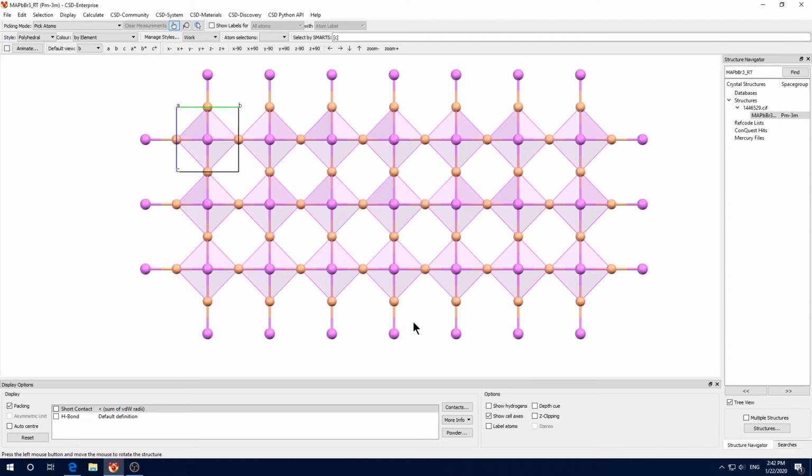Then the next step, I will show you how to customize your own favorite style. This is the default style or the style you set before. If you don't save it, it will revert back to the default style. In this case, it is the previous style I just used. But here I want to show you how to customize it to your favorite.